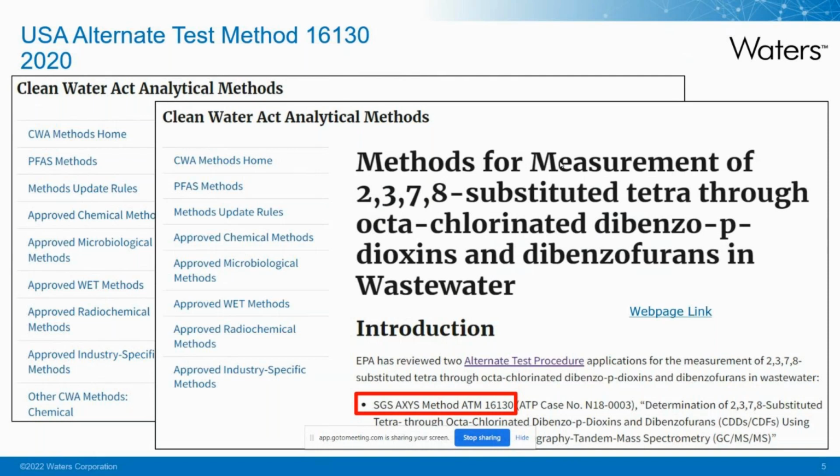16130. And this again allows for confirmatory dioxins analysis to be performed with either EI or atmospheric pressure ionization GC-MS as an alternative to high resolution magnetic sector MS. And again, the drive behind this being to reduce the cost, to reduce the size, and maintain support as more and more magnetic sectors come to the end of their manufacturing lifetime.